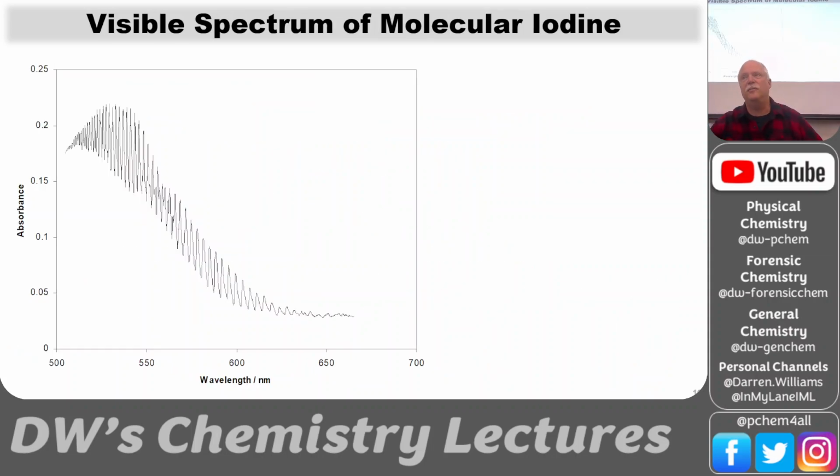So here's the spectrum. Here's this peak picking guide. I mean, put a big star on this page. This is the key to your lab. Okay, this is how you get started. So this is the absorption spectrum of iodine.